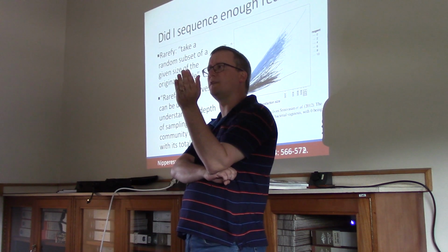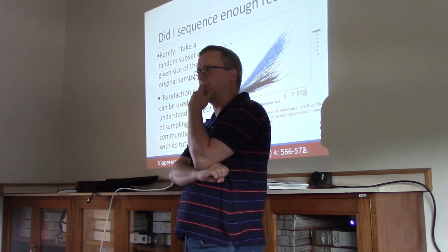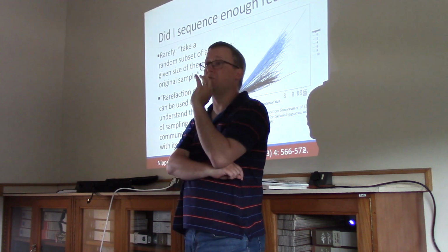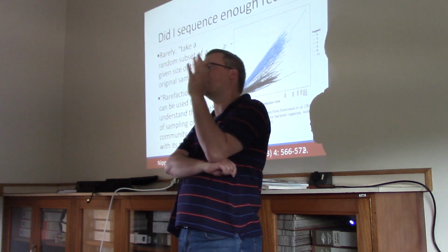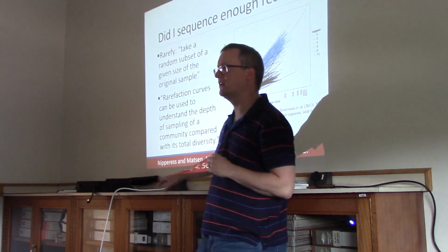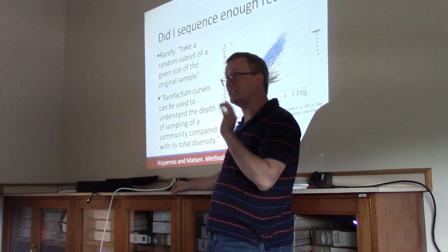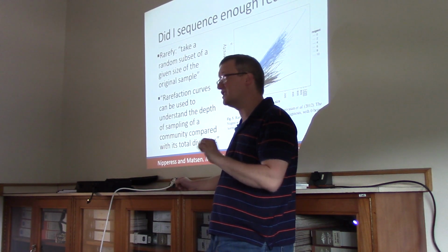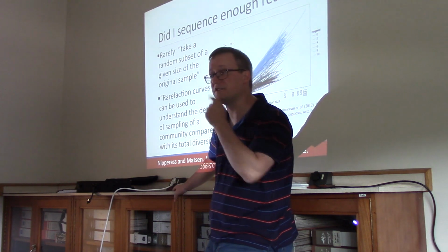So a natural question should be, well, next-gen sequencing has obviously been around for a long time. Is everyone familiar with an Illumina MiSeq? Have people heard of these? Okay, it's a really popular kind of desktop model sequencer from a few years back. But I would stress that at this point in time, an Illumina MiSeq is not considered a contemporary instrument. It's really been surpassed by later ones.